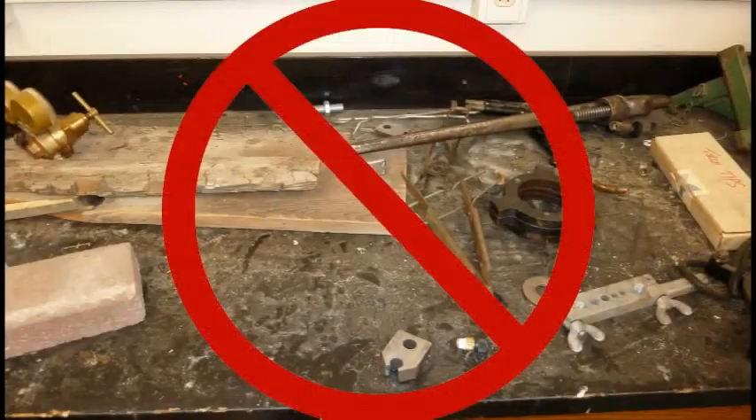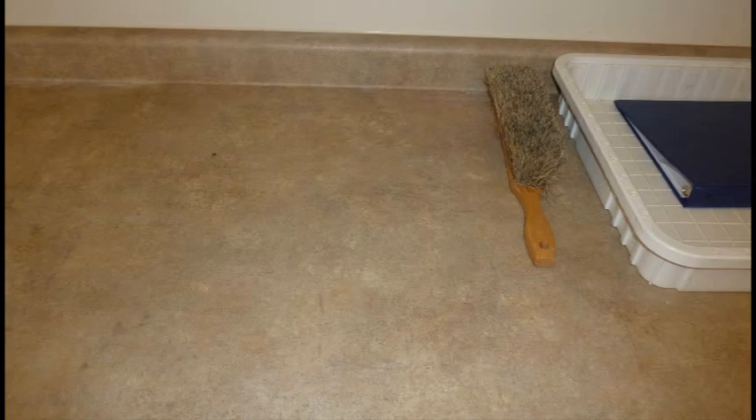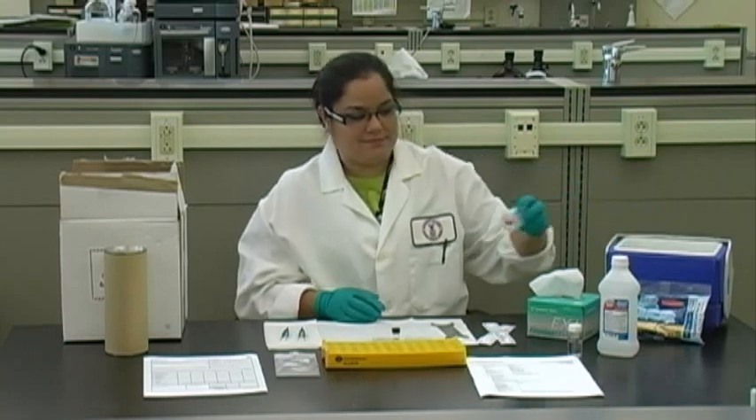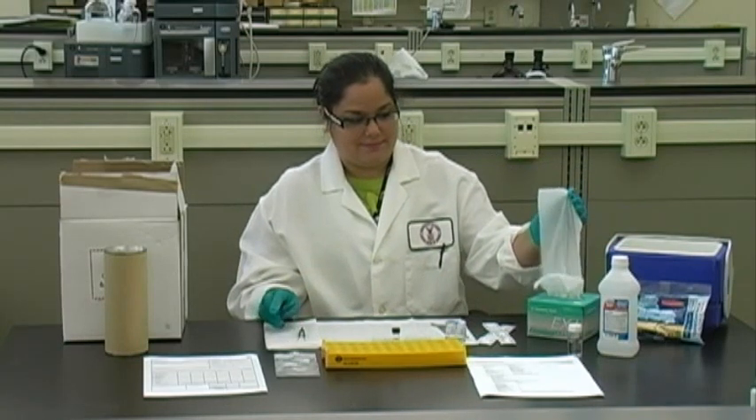As soon as possible after sampling and in a clean location, prepare the sample for field extraction. Field extraction will be of benefit only if it is performed immediately after sampling. Carmen will demonstrate the field extraction procedure.